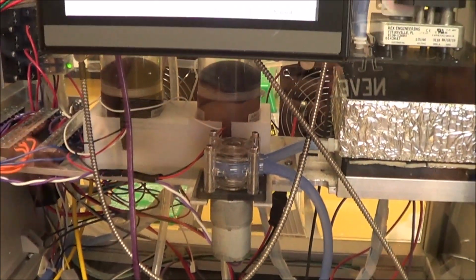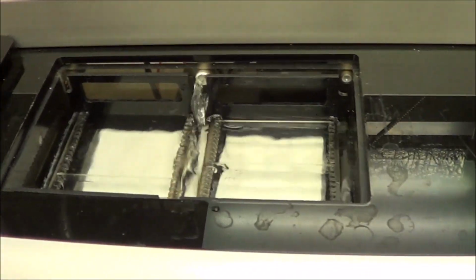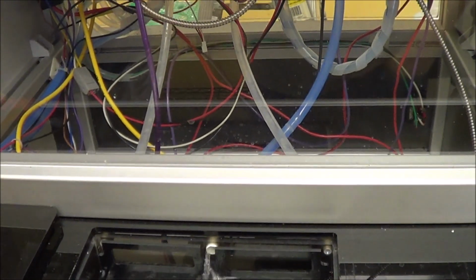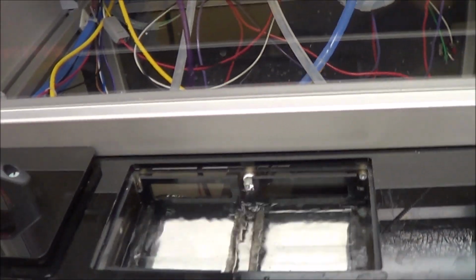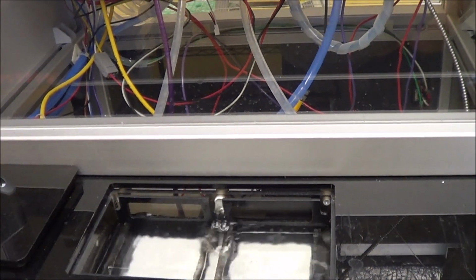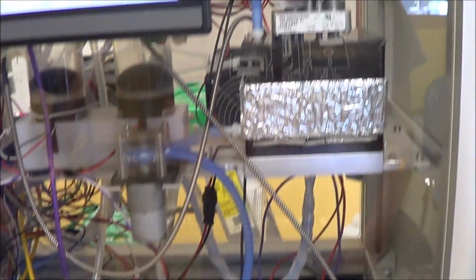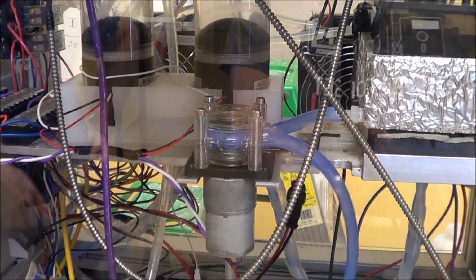That's the total progress, the blue one, and the green one is the current stage step process. It hasn't started yet because we're transferring. So we're getting ready. It hasn't started yet. The timer is not running. As soon as we finish, you will see the green bar for that specific step.